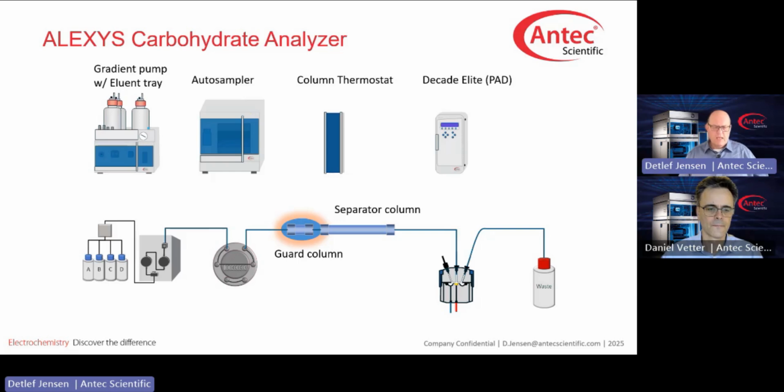Now, what you do in your sequence, no matter whether you run isocratic or gradient separations, you always should have one standard available, and just take one of the calibration standards that you have anyways and apply an isocratic separation. Take one of the late eluting peaks from this standard and follow its retention time.